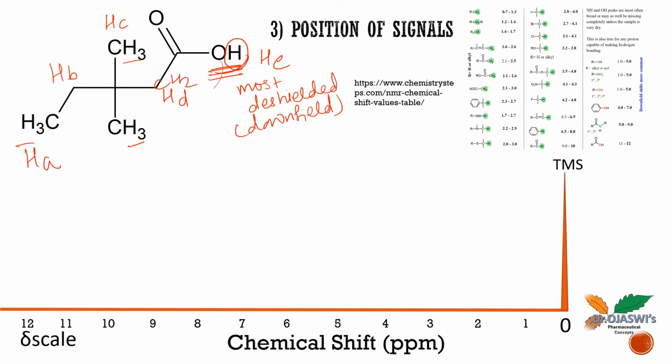Yes, this region which is away from TMS is called downfield, and this region which is towards the TMS is called upfield. See, this is not like IR.